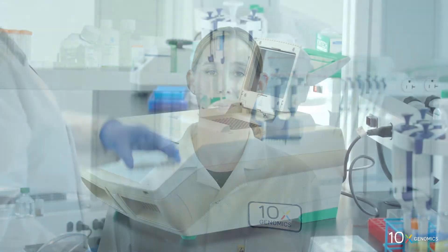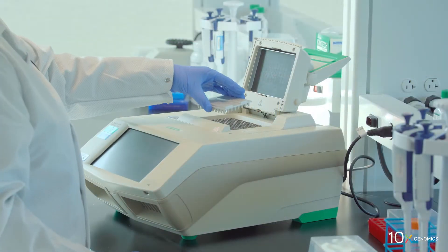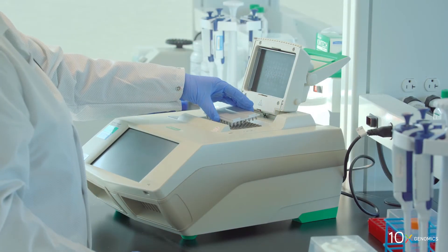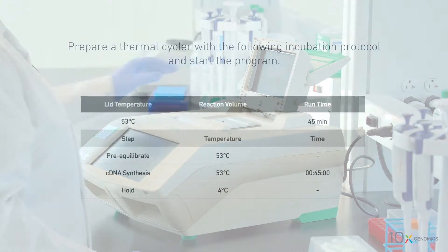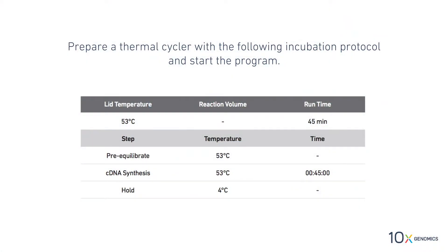We have completed tissue permeabilization. Now we will perform cDNA synthesis. Place a thermocycler adapter in the thermal cycler. Prepare a thermal cycler with the following incubation protocol and start the program.